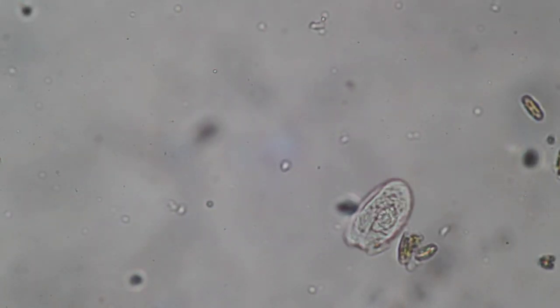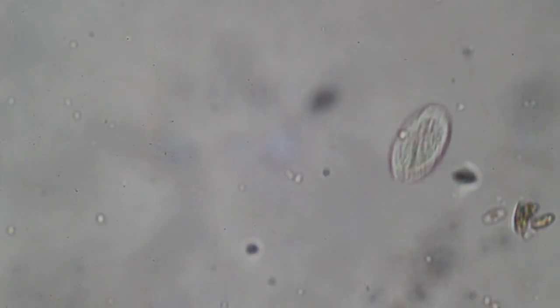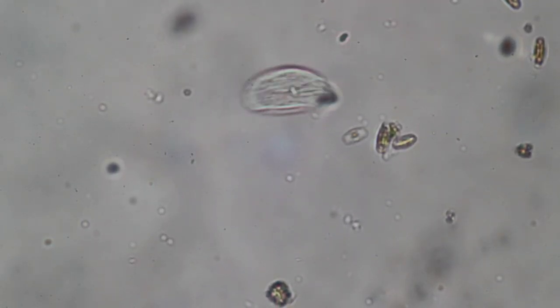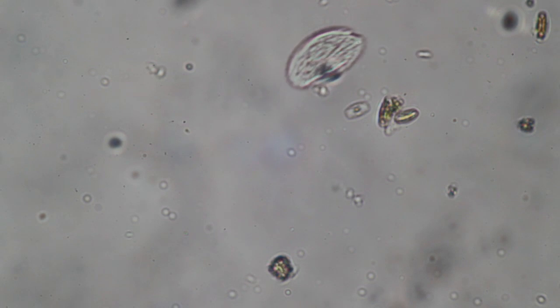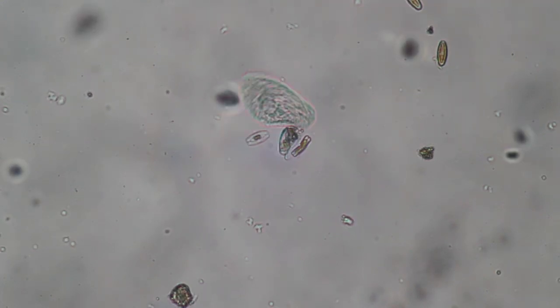That's not a rotifer — or is it? No, it looks more like a free-moving ciliate. I'm circling these three diatoms in the middle.